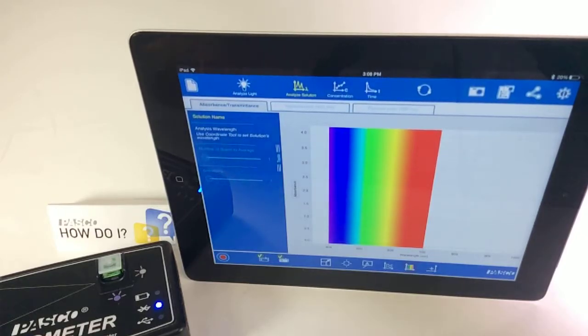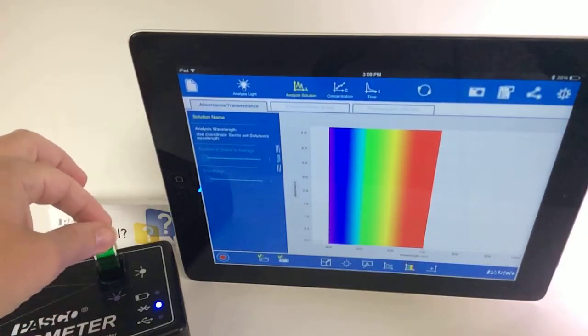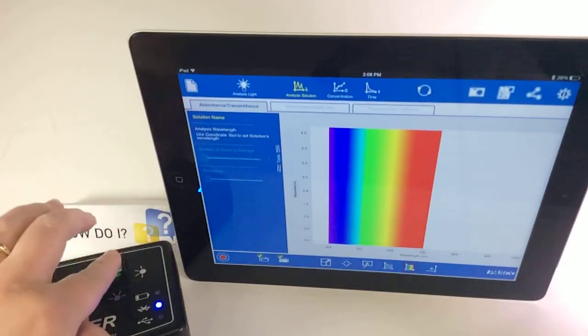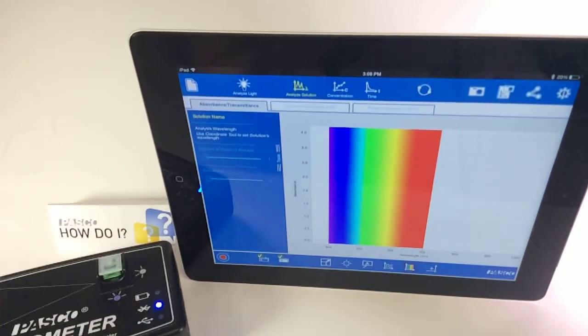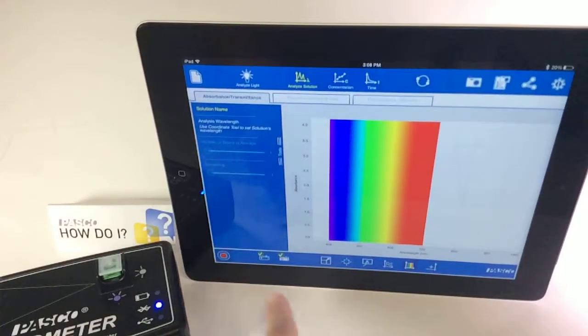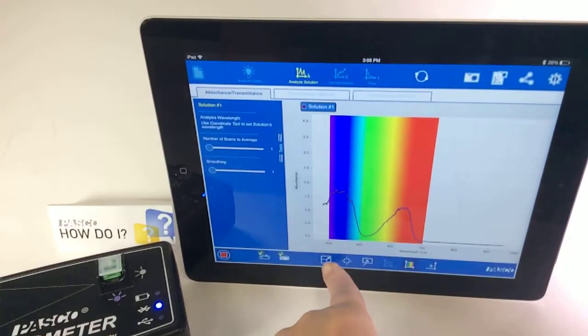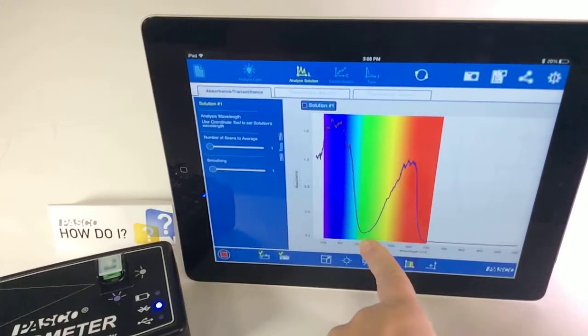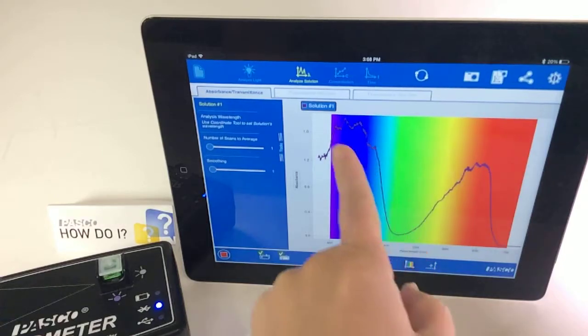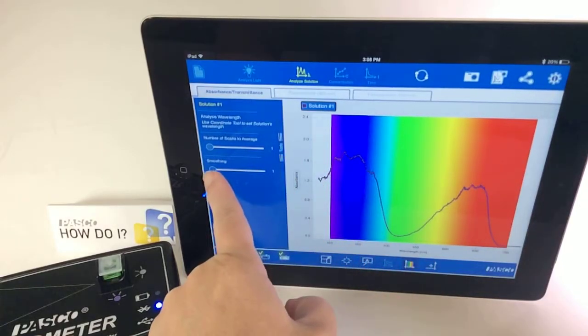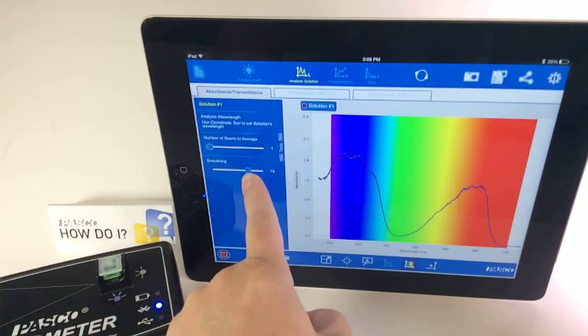So I have my colored solution in which the reaction will take place in the spectrometer. I'm going to begin data recording, and while data is recording, I can auto scale and manually scale, and I can also use the smoothing option.